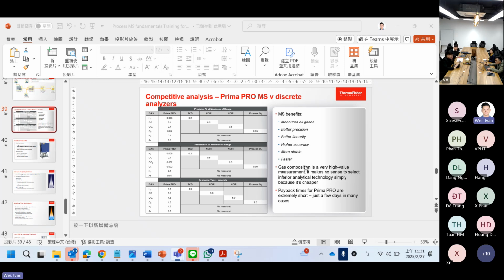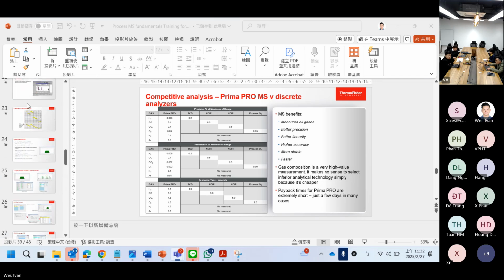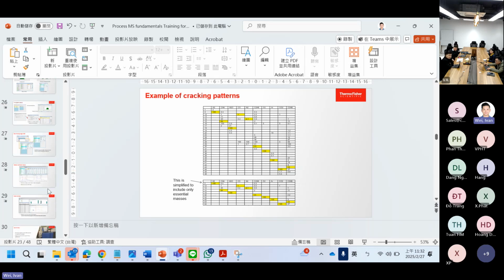Mr. Long, let me come back to you. For the comparisons, I'll come back to you with another comparison, but what needs to be measured is something that we need to discuss with the customers. As you can see earlier in the slide, we can measure many different compounds, but we need to know their molecular weight. We do know some typical compounds that we may be able to measure.